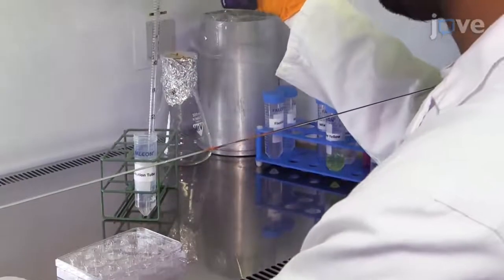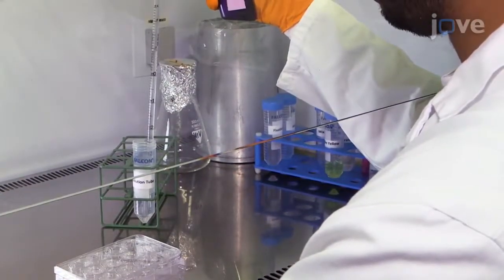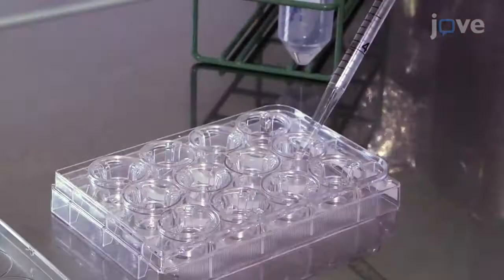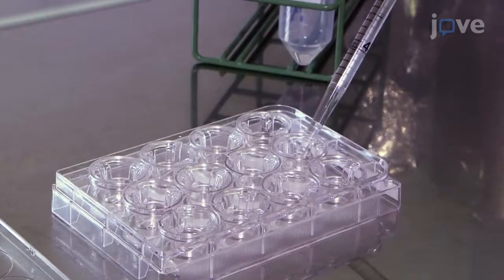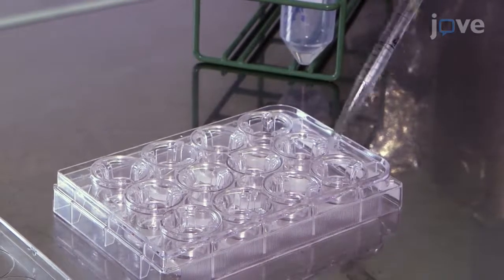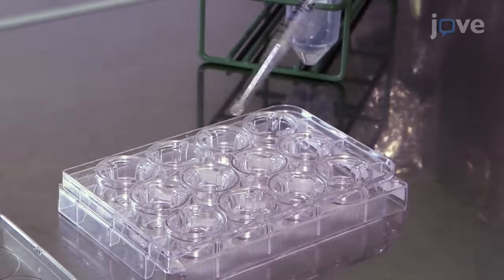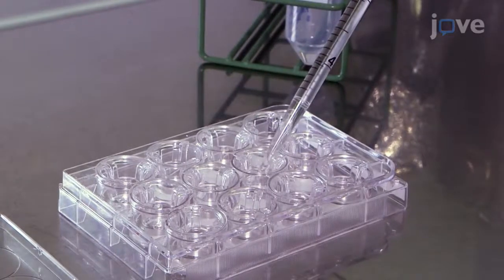To set up a BBB mini-brain polyester membrane culture insert device, dilute the cells to a 5 x 10⁴ cells per insert concentration in complete endothelial cell medium and add the appropriate volume of cells to each polyester membrane culture insert in a 12-well plate.